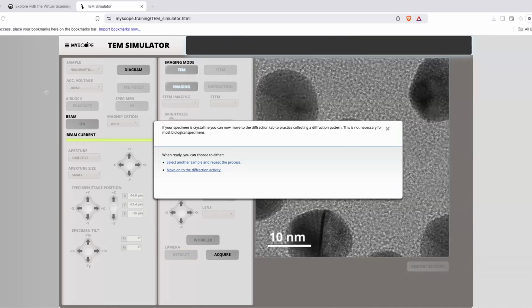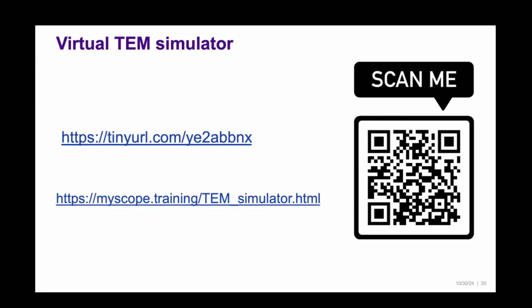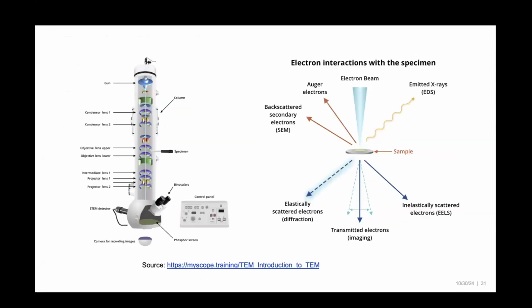Yes, so here is an image where you can see individual atoms. And you can change to different materials if you want. Then the instruction says if you want to continue to the next step, we are not in that step, but the idea is that you have seen how this is done. So this is a bit challenging.